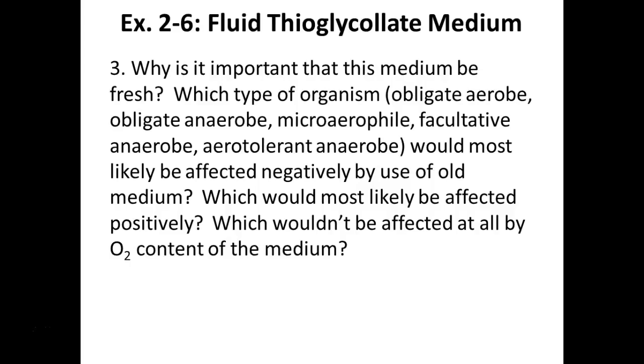So, why is it important that the media be fresh? What are we trying to grow? Anaerobes. Or know if your organism can grow anaerobic. So again, we don't want a lot of oxygen in the tube. So we want to use fresh media so that our anaerobes can grow. Would it affect our other organisms that utilize oxygen? No, they would be happy because there's plenty of oxygen, but our results would be inaccurate. Because we wouldn't know that it was an aerobe versus an anaerobe if the oxygen had diffused through most of the tube.